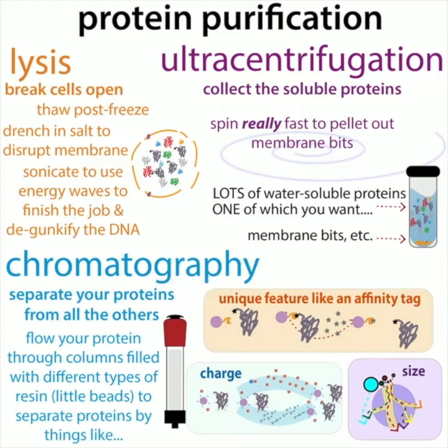But when you do this ultracentrifugation step, you remember you can also just use a normal centrifuge, going as fast as you can, if you don't have an ultracentrifuge available. Basically the membrane bits are usually going to be in your pellet. So this is going to be like the non-water soluble stuff. So we're going to be assuming throughout this video that you're trying to purify a water soluble protein. So just like a normal protein that hangs out in the cytoplasm, the general interior of the cell, and not like a membrane bound protein, which you would expect to find in the pellet.